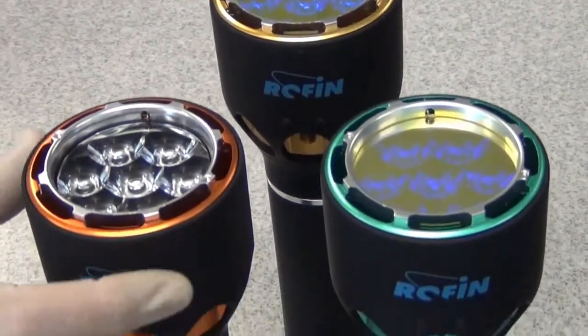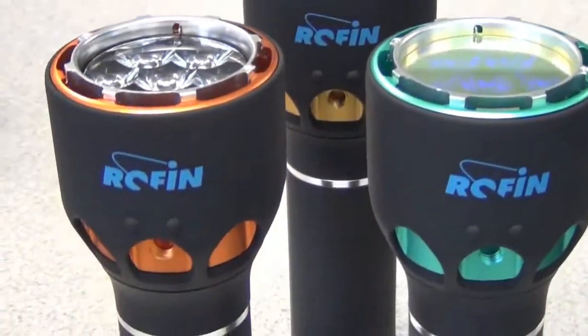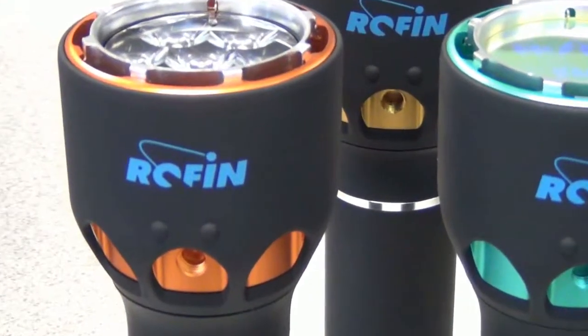Next we have a heat sink — this thing around the light — that cools the light source down, because the light sources emit a lot of heat.